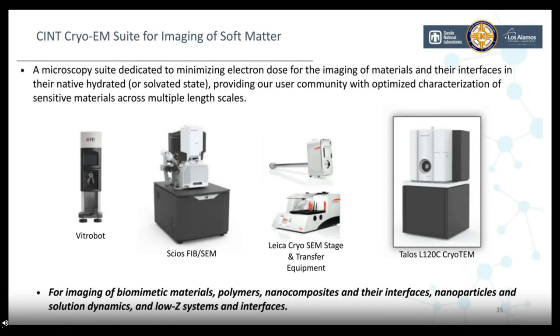So the CINT cryo-EM suite. Dan touched on a few of these tools, but I'll give an overview as to what we have and some of the unique capability. This is a microscopy suite dedicated to minimizing electron dose for the imaging of materials and their interfaces in their native hydrated or solvated state. We've actually recently done some experiments with freezing toluene, providing our user community with optimized characterization of sensitive materials across multiple length scales. And it's actually the Leica equipment that really helps us to cross those multiple length scales.